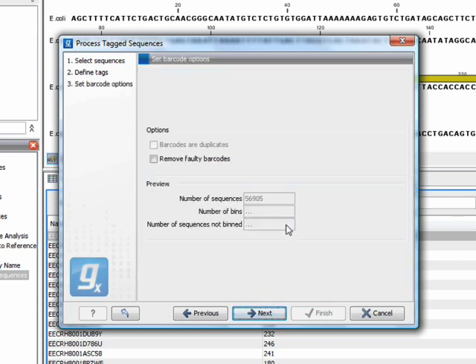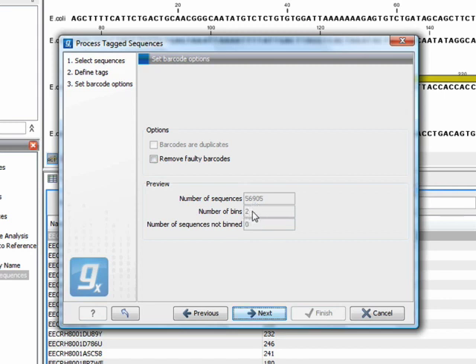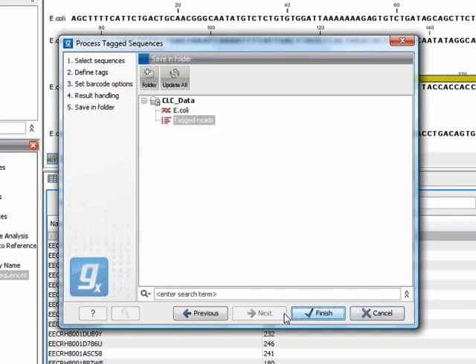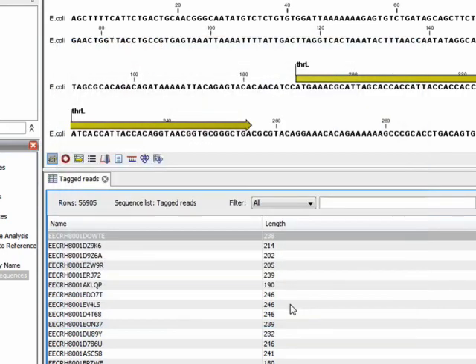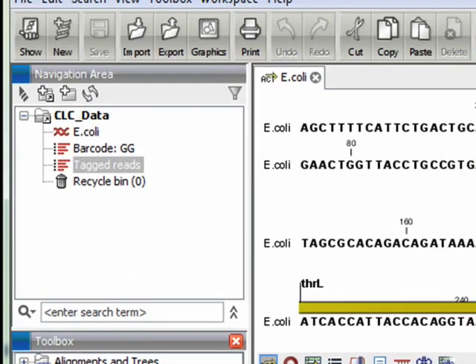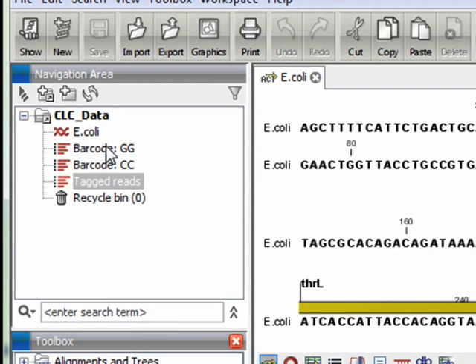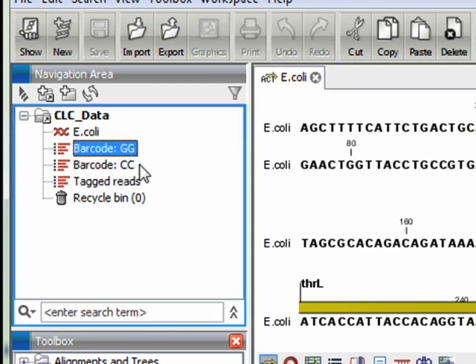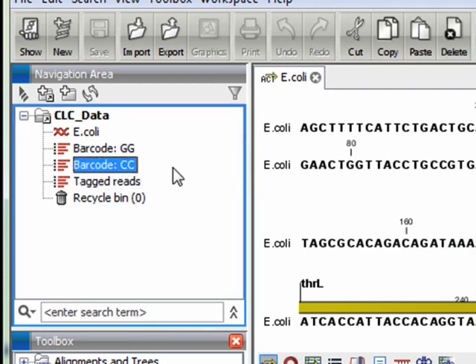The wizard will now calculate that out of the 57,000 reads, there are two different barcodes found, and it will now create two sequence lists for us, one for the barcode GG and one for the barcode CC. For the E. coli experiment, we want to look at the CC barcode.